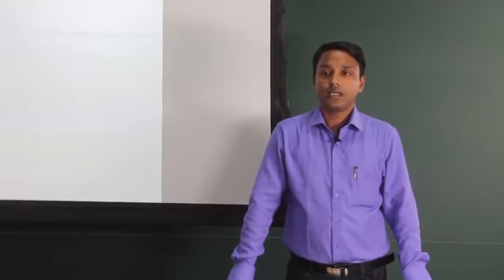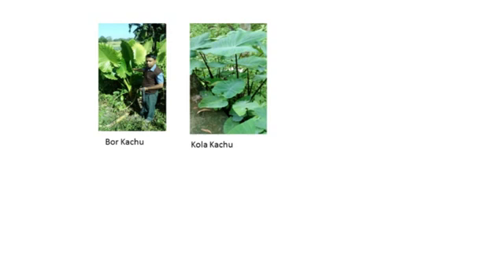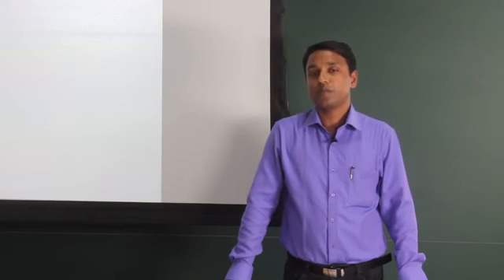We collected 5 different types of colocasias from our locality with the help of our students. Then we tried to find out the oxalate ions present in them. We collected wild colocasias and found the oxalate ion with the help of a titration which is in the class 12 syllabus. In class 12, the students study the oxidation reduction method. This titration is also there in the chemistry practicals, and some investigative projects are also in their syllabus.